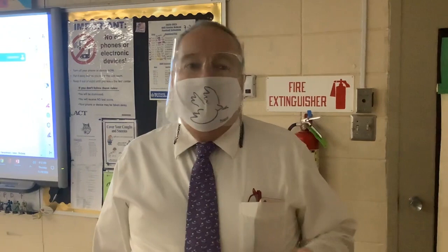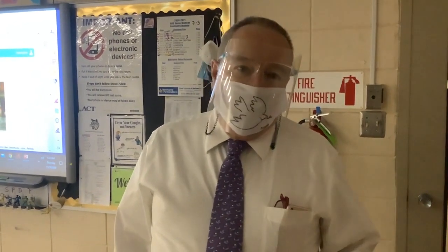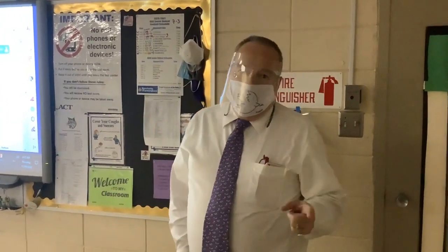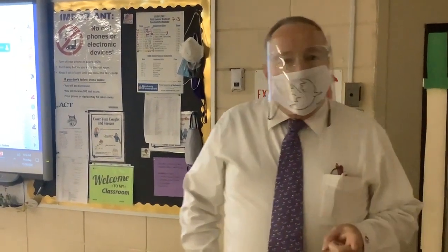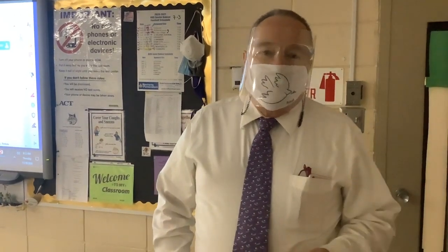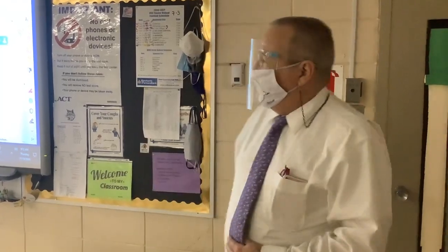I'll run through the lab procedure, and then there'll be an accompanying video dealing with the debriefing and the lab discussion so that you can complete your lab report and get your grade. Don't forget, the lab reports play a significant part of learning chemistry, and more importantly perhaps to you, a significant part of your grade. They count 25%, just like our quizzes and tests.